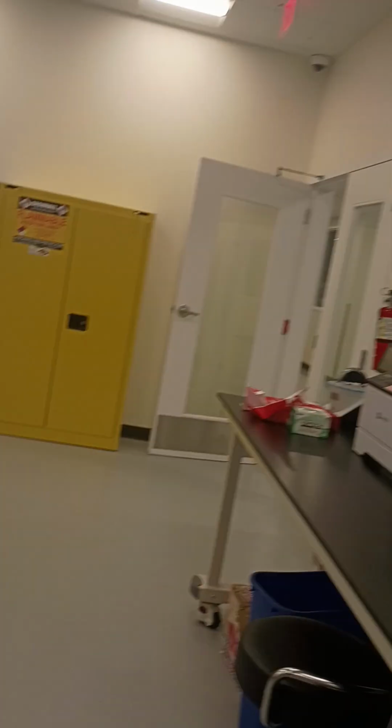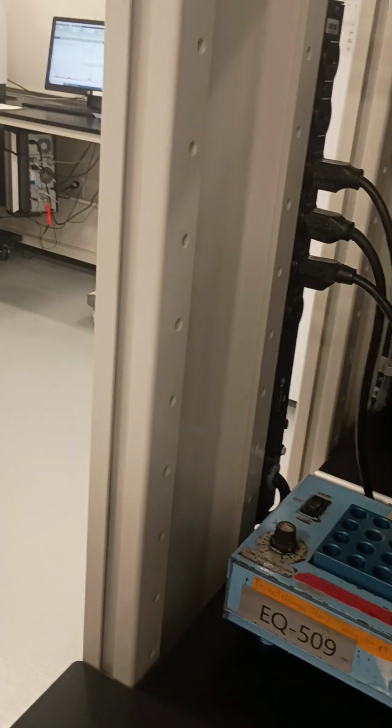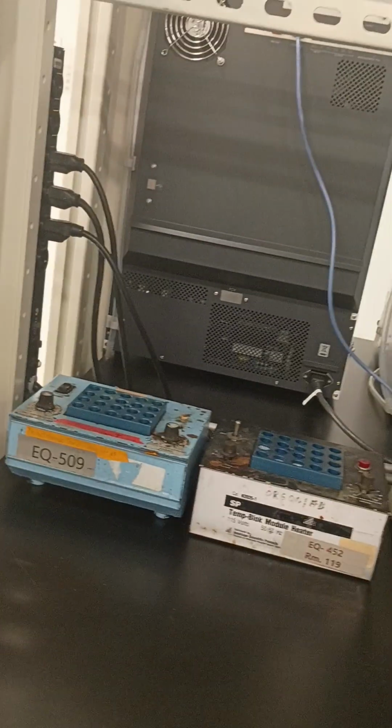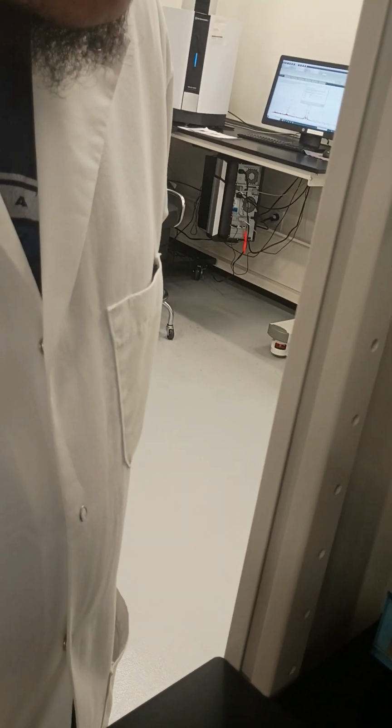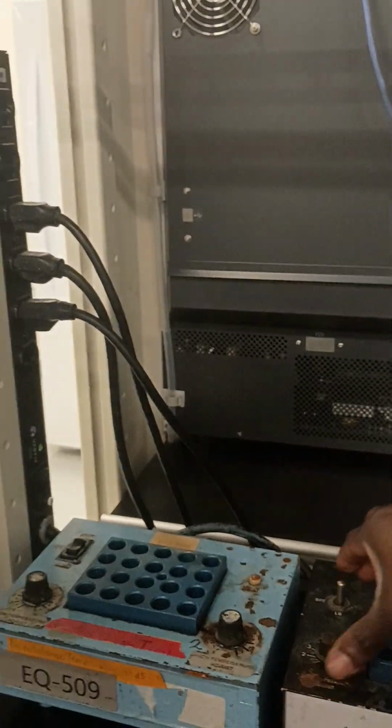Some of the stuff they always forget also is the hot plates. Like right now, it's on, so you always make sure your hot plates are turned off. I always double check at the end of the night before I leave. So this is off, this is on high, on low, that's off. Off in the middle. On low, off, on high, off.